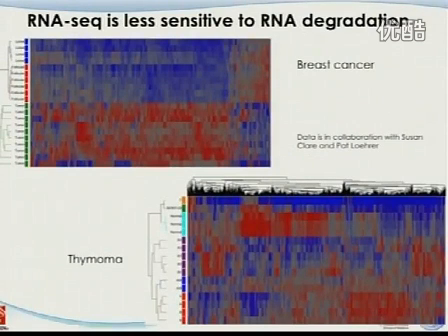And this is some of our data. These are two examples: one is breast cancer, the other is thymoma. Actually, the next guest lecturer, Milan Rajovic, produced both of these data sets. It's a really nice study. For the breast cancer, these are normal breast, not cancer, and these are triple negative breast cancers. And these are different stages of the menstrual cycle in the month. You can see that the data really perfectly clustered together.